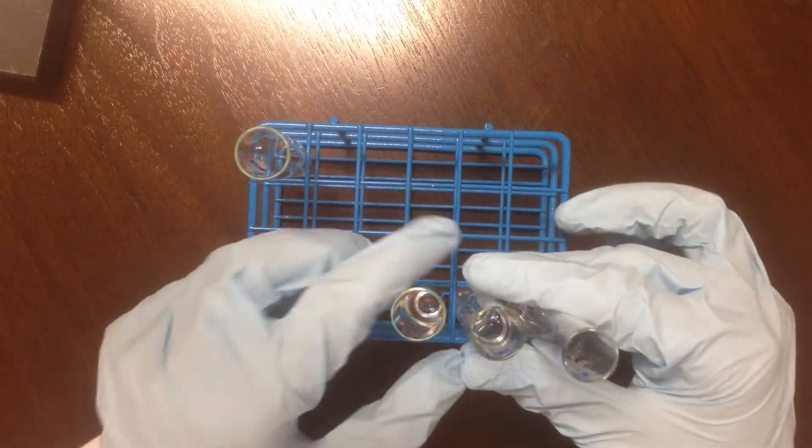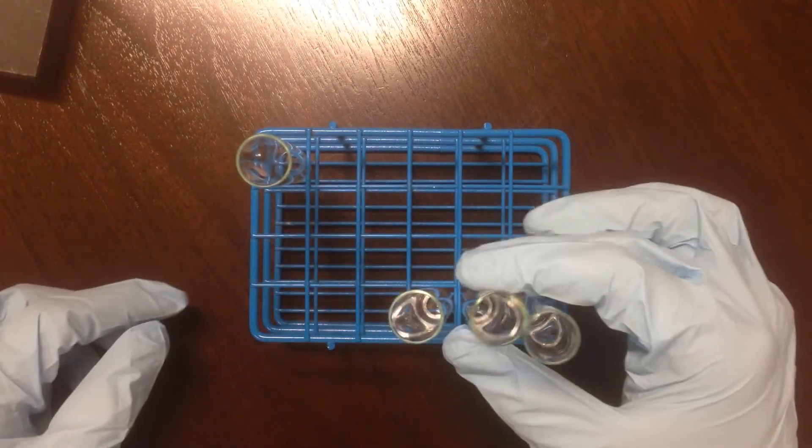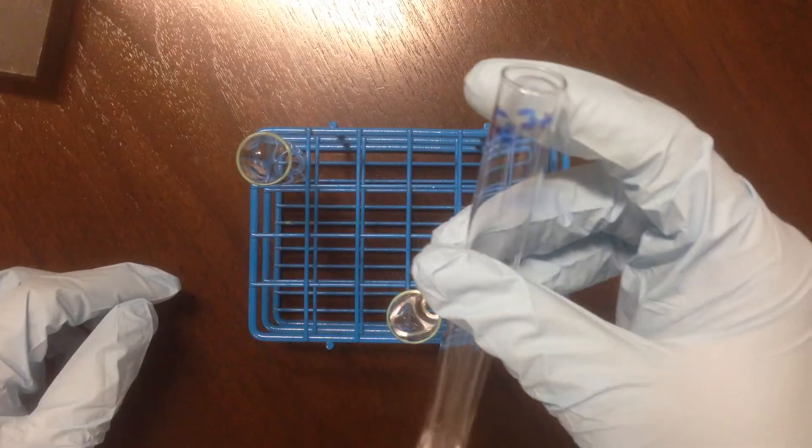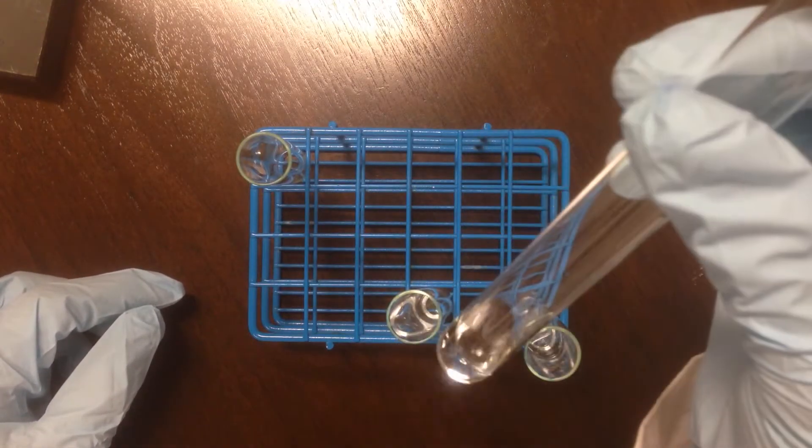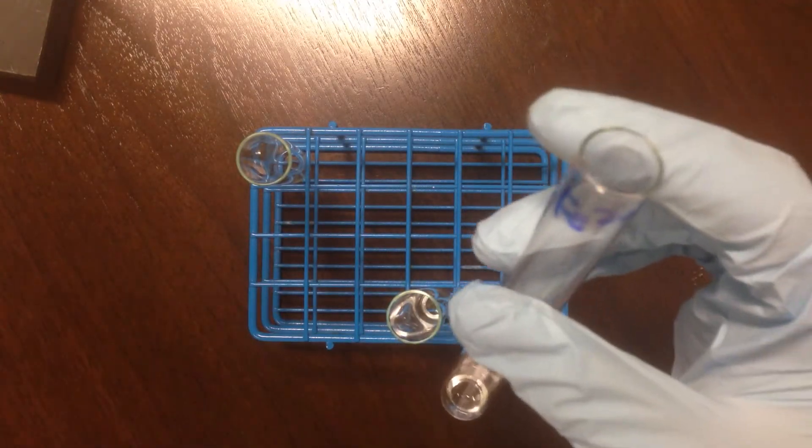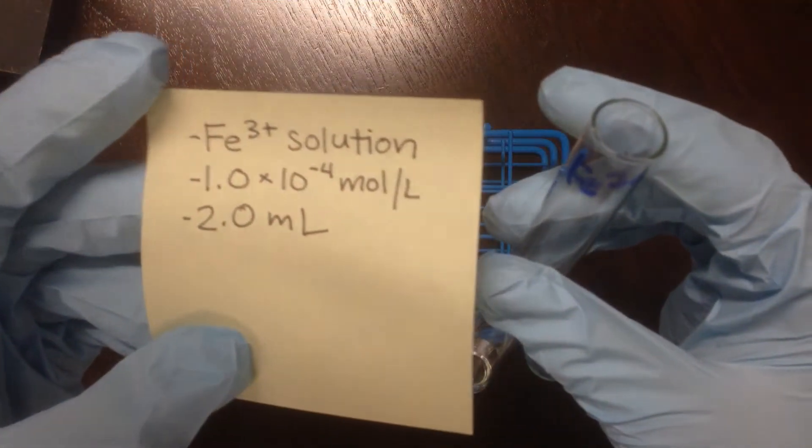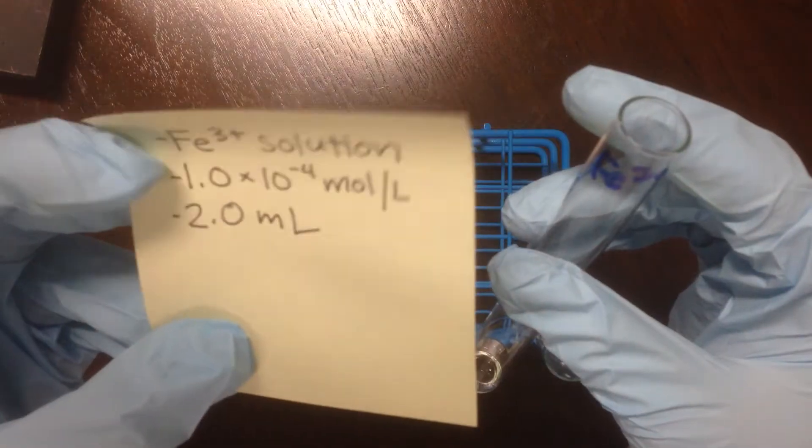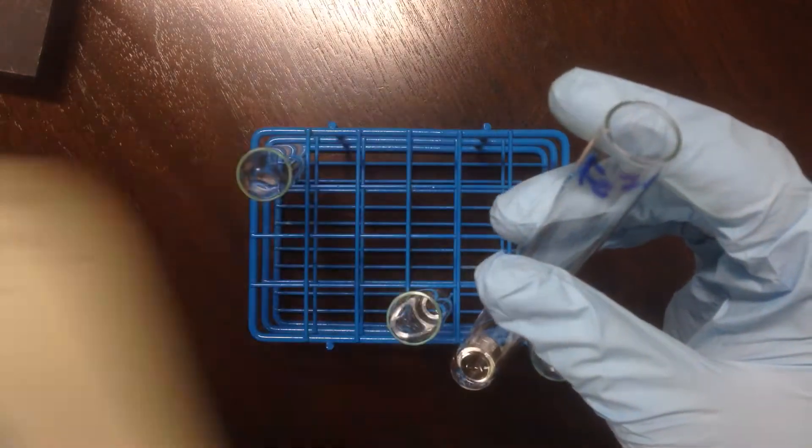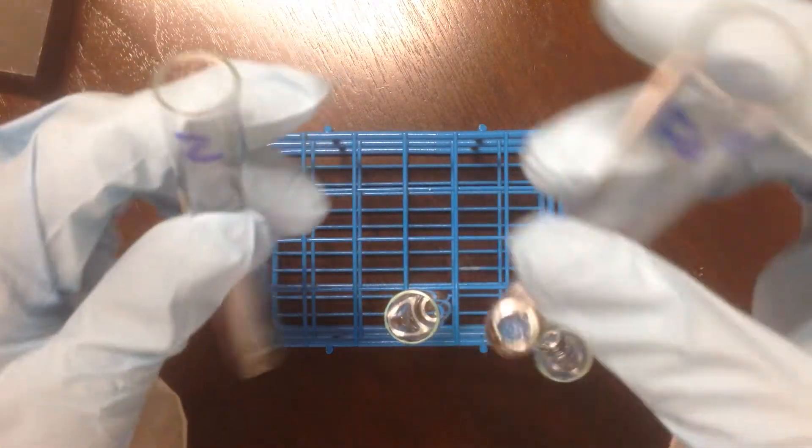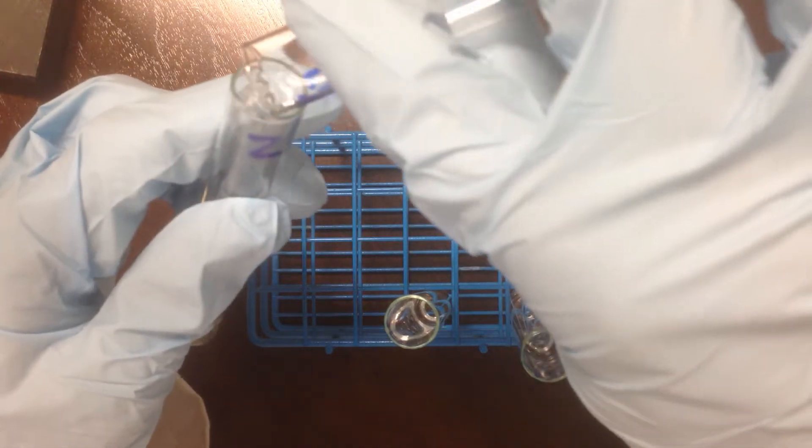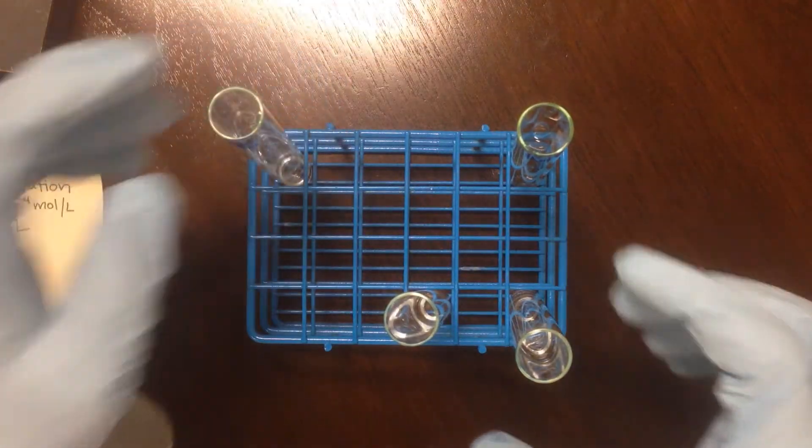I've got three test tubes containing the three solutions to be added to the holding tube. The first is the Fe³⁺ tube. You can see it's a transparent solution there. This is 2 milliliters of a diluted solution that has a concentration of 1×10⁻⁴ moles per liter. This is diluted relative to the stock. I'm going to add this in first to tube number 2.